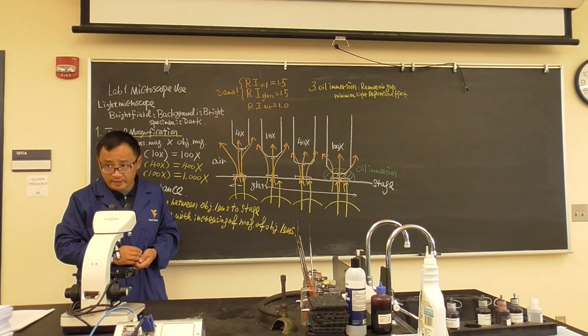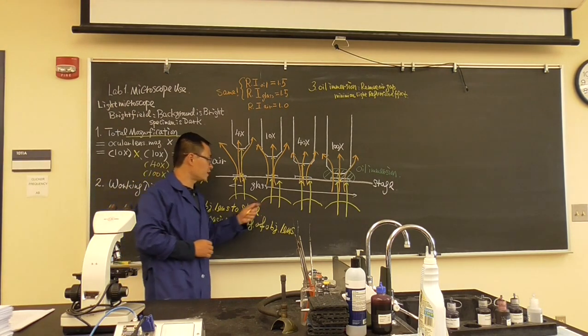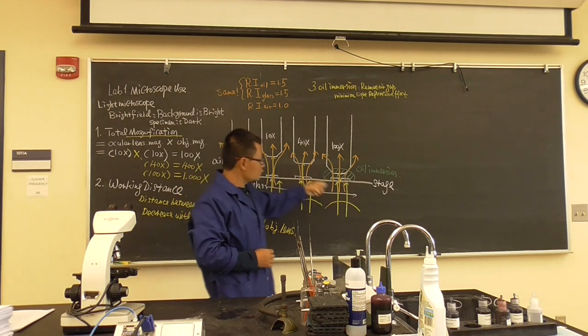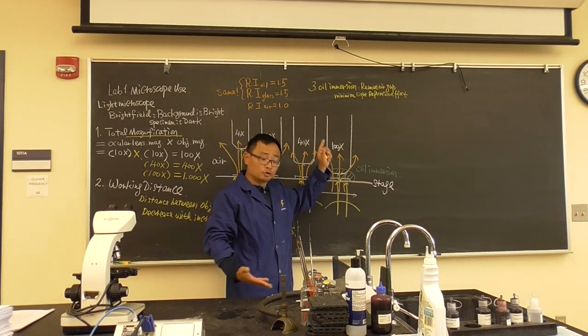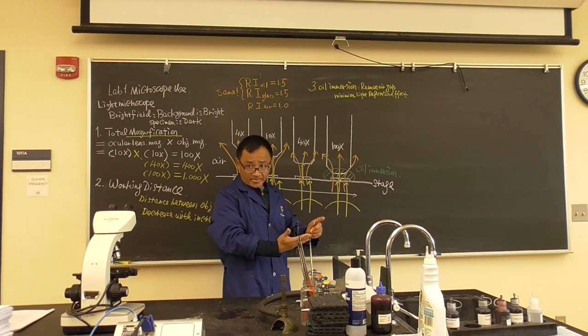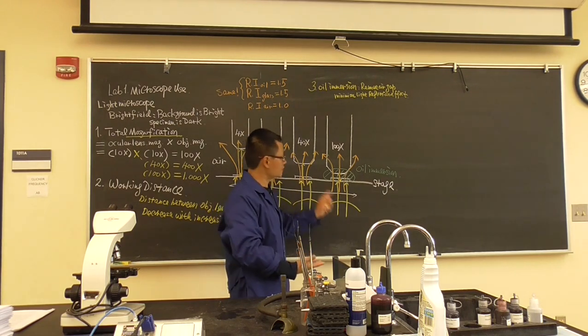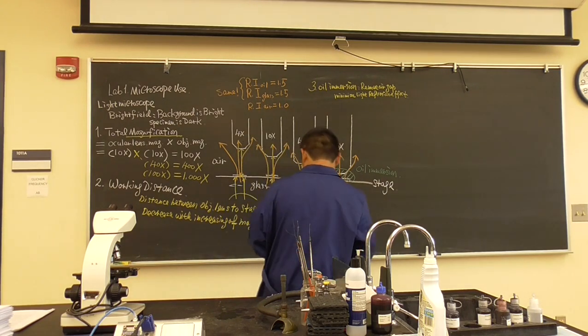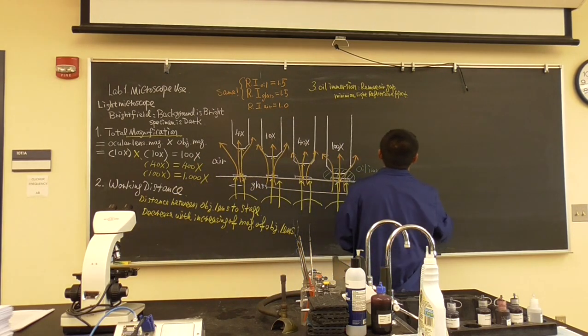Therefore, underneath the microscope, we usually use 10x to find the specimen. Then we switch to 100x. We add 1 drop of the oil. They look like they are connected. And then we can see the morphology, which means the shape of the bacteria. Okay, so that is the story. So number 3 is what we call oil immersion. Okay, number 4.